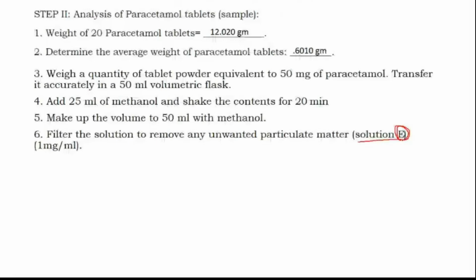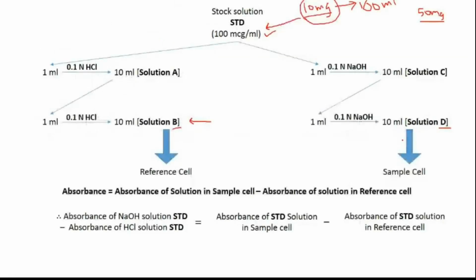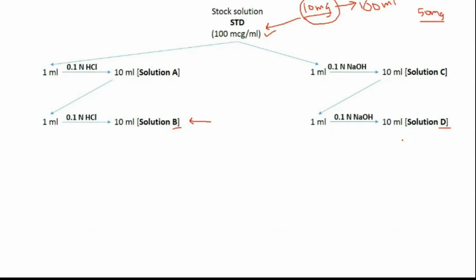Before diving into the dilution of the stock solution, you have just done the tablet calculation. Below that you will write dilution scheme. Please write down dilution scheme for stock solution. Dilution scheme for stock solution. Then you will write down the dilution scheme that is given on the slide. That is all you will write.